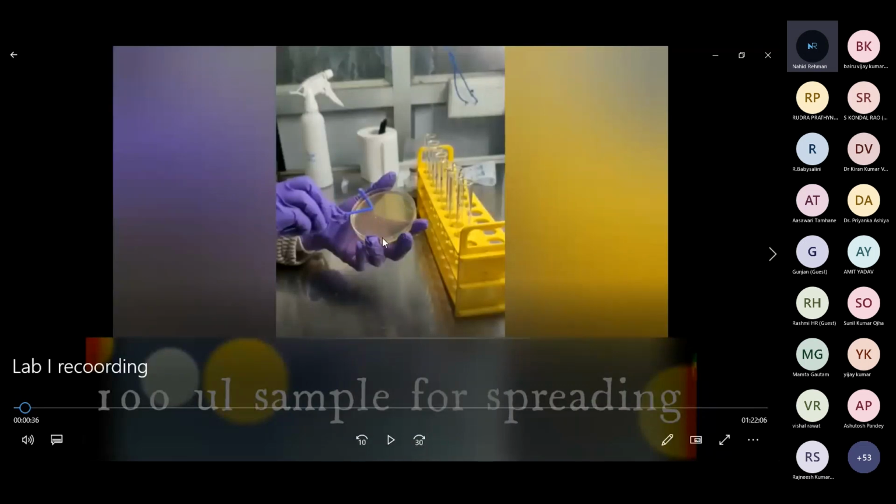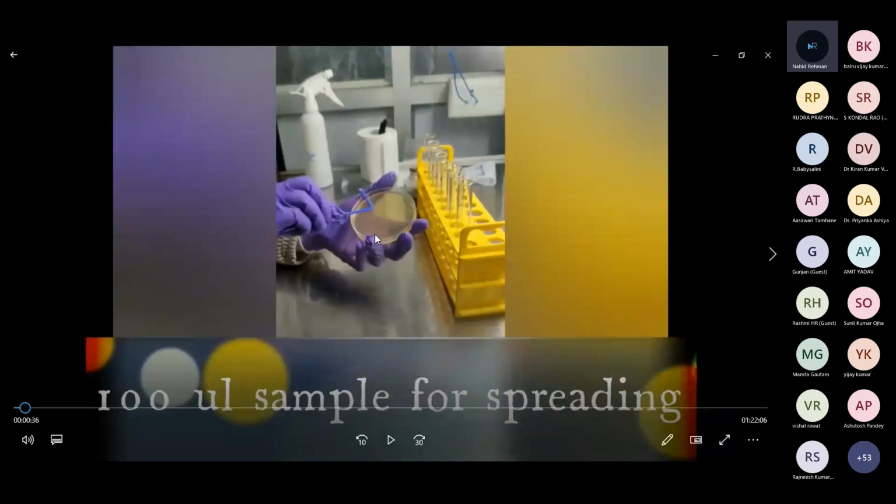I suppose all of you will be aware of this Petri plate. If not, I will tell you that it is a kind of disc, and that disc has a lid also. You can commercially buy sterile Petri dishes, or you can use glass dishes. If you are using glass dishes, they are washable, and then you have to sterilize them in an autoclave to make them microbe free. And here you have to put the media. The media is nutrition for any microbe to grow upon it.